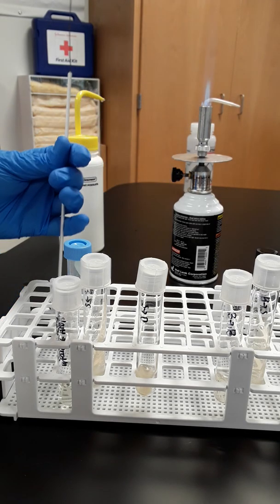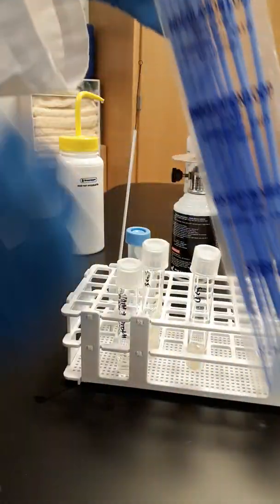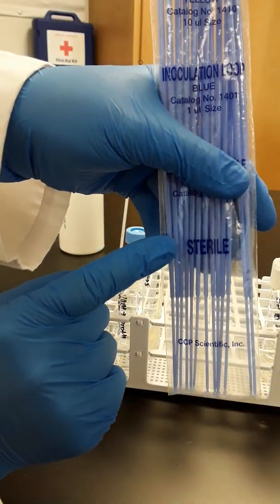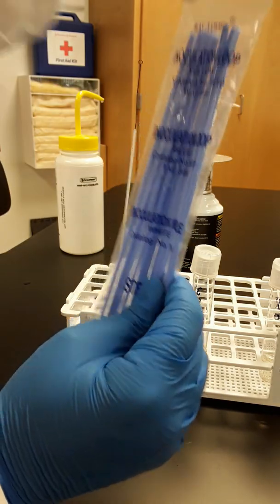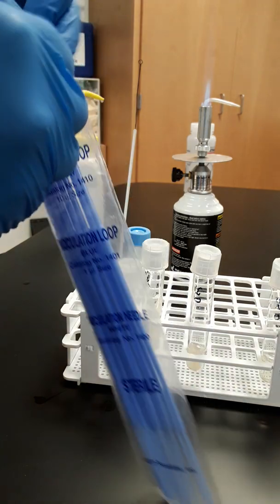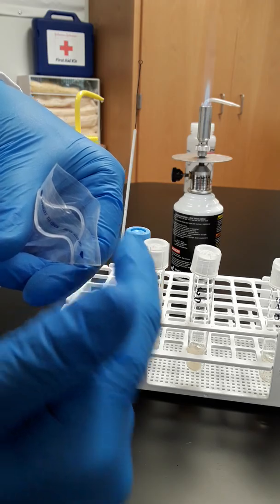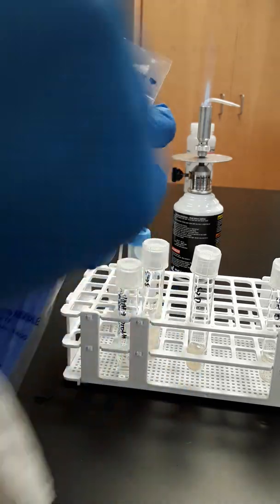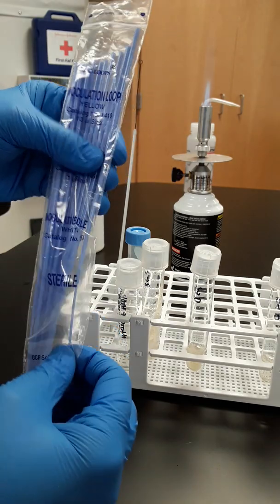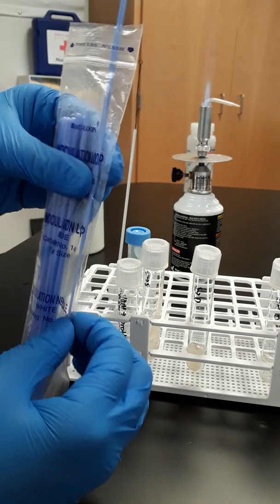And we're going to put this aside, because for the deep tubes, what we need is one of these inoculating loops. On here, it tells us that these are sterile, so we do not want to reach in with our fingers and grab it. Instead, we have to treat this just as we would any other sterile technique. So up here is like the dirty area, so we can touch up here to open the bag. But then after that part, you want to push just one all the way up and out, leaving the rest down and in the sterile area.